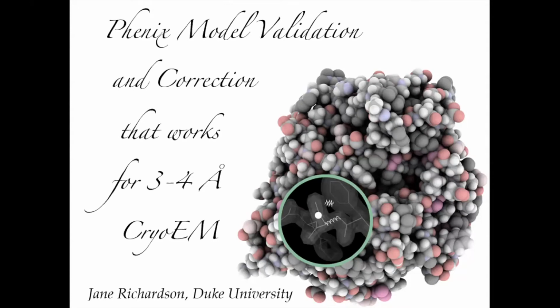Some of the things about validation have already been covered, which is really great, because validation is not something you should wait until the end to do. You ought to be doing it all along, and that's even more true at cryo-EM resolutions, or 2.5 to 4 angstroms, than it is at higher resolution, as Pavel had pointed out.